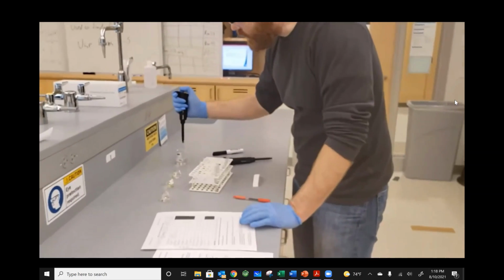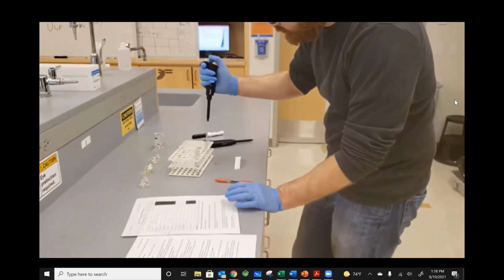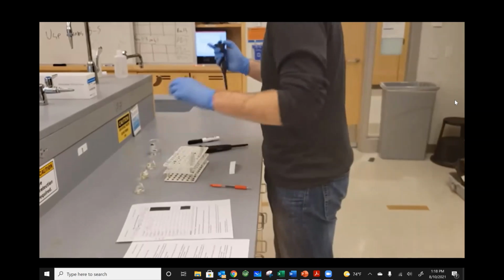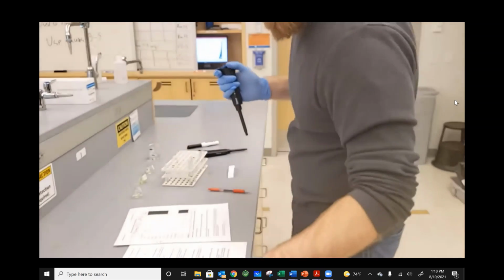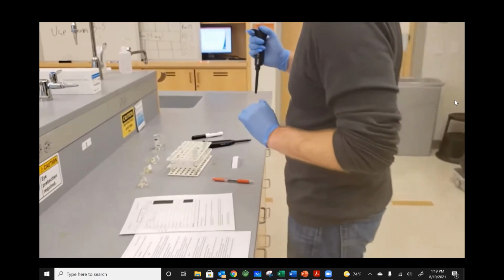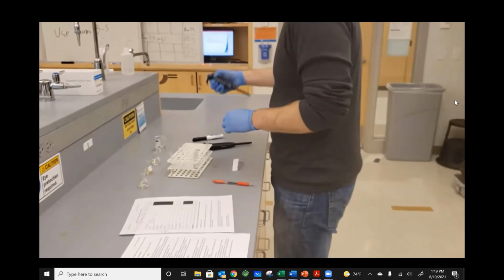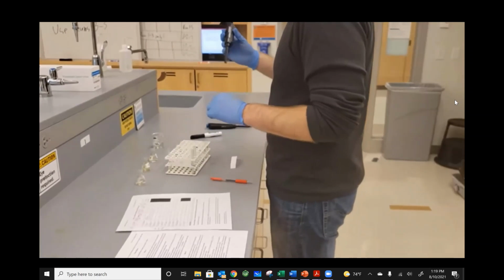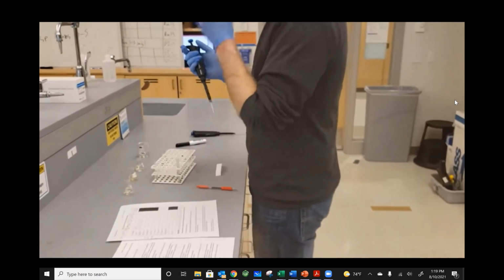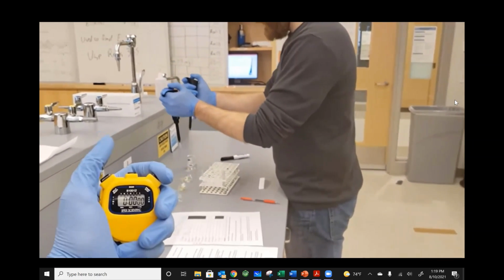200 microliters of deionized room temperature water. Now I need 200 again microliters of our starch solution and 1,000 microliters of our hydroiodic acid. So if you will ready the stopwatch, get this ball rolling.